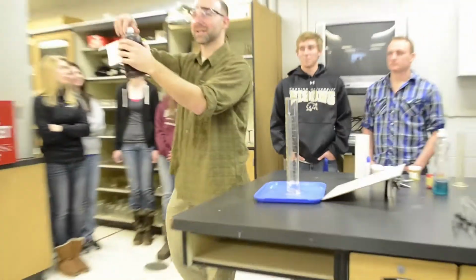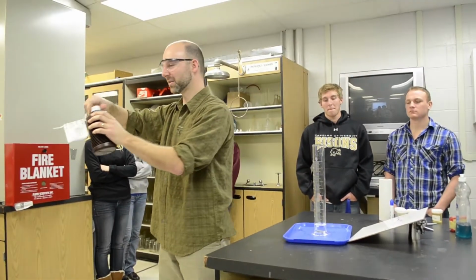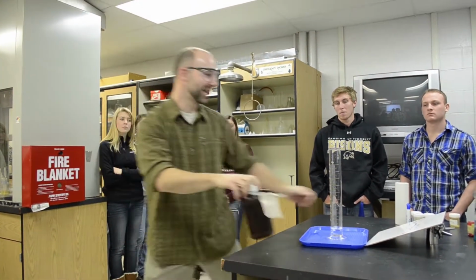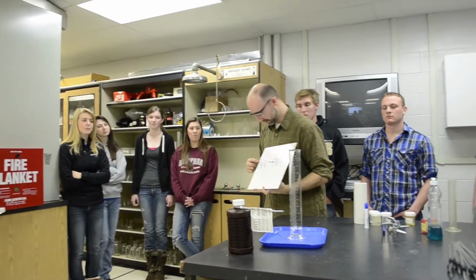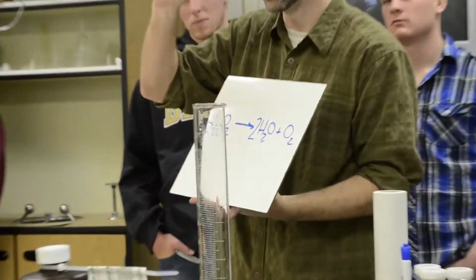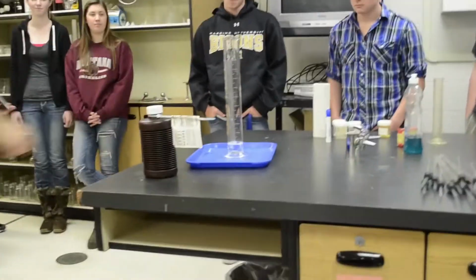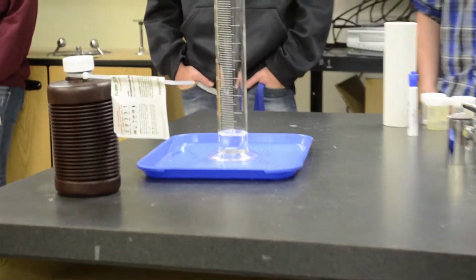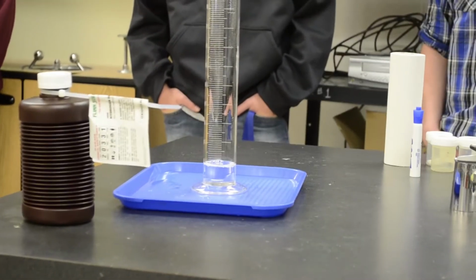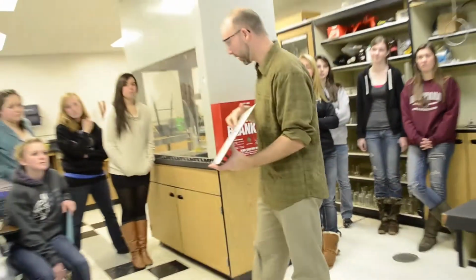Okay, that's hydrogen peroxide. It looks like hydrogen peroxide in the bottle, right? Why do you think that they put it in a brown bottle? Because it decomposes under light. Yeah, that's right. It doesn't take much energy. The activation energy required here is like a little bit. If I held this up, you can see it start to bubble right now a little bit, right? Just in ordinary life. If I held it up a little bit closer to the light, that would be enough energy, just a wee little bit, for these molecules to collide with enough energy to break apart.